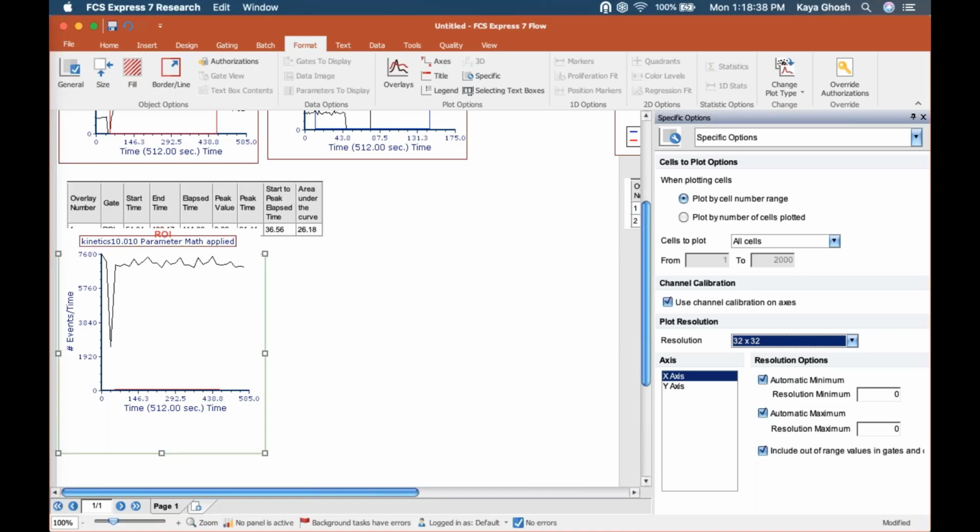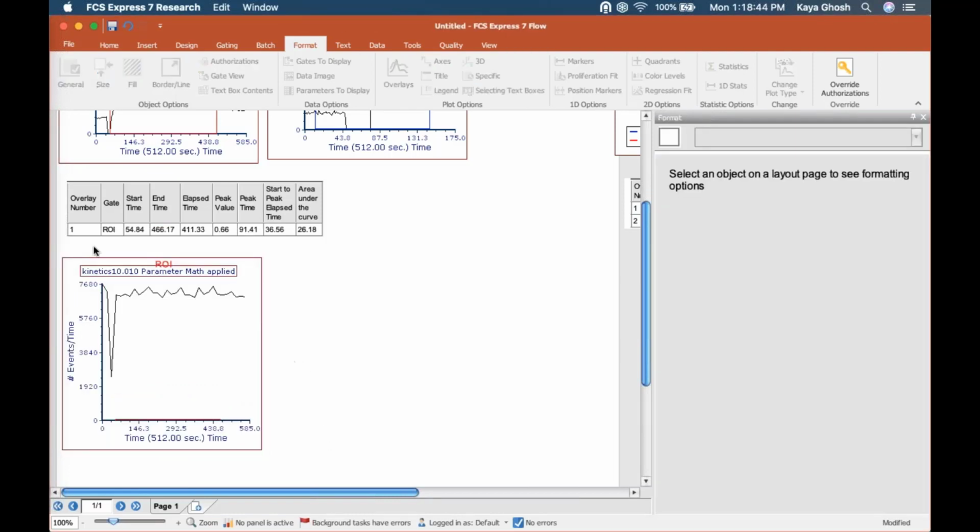And then this valley here, let me highlight this valley. Okay, sorry, my drawing tools have ceased to work, which sometimes happens on my Mac. But basically this valley here near the left side of the peak, I'm going to move my mouse cursor around it.